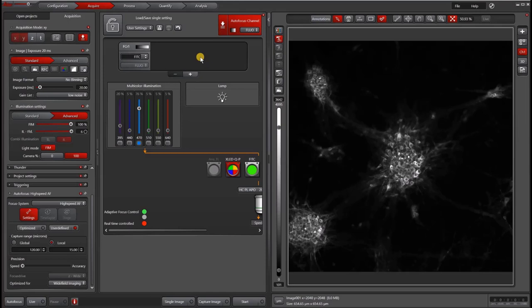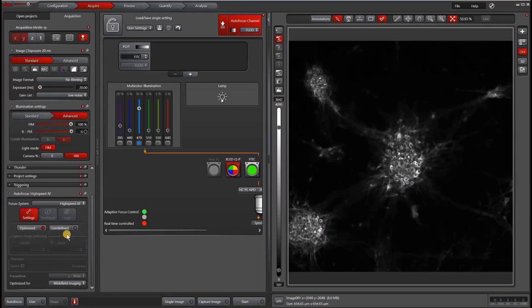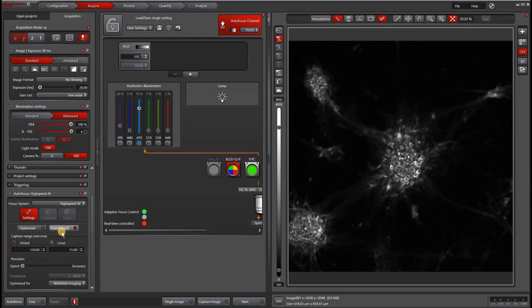If I go back to my autofocus window, you can now select between optimize and user-defined. Optimize will be just some generic settings, which by default, it's usually optimized for speed.